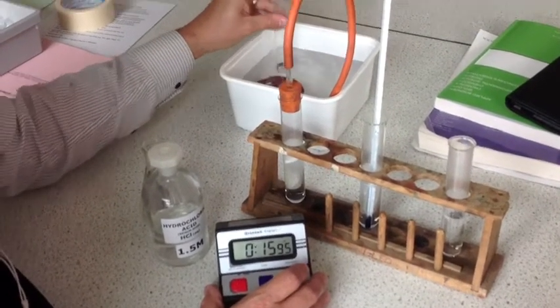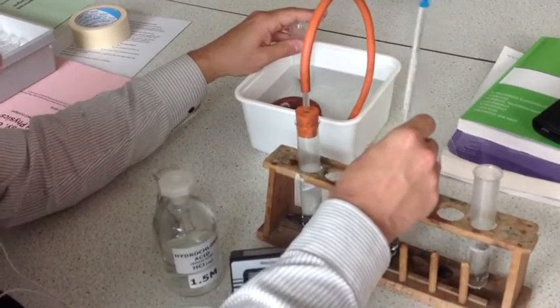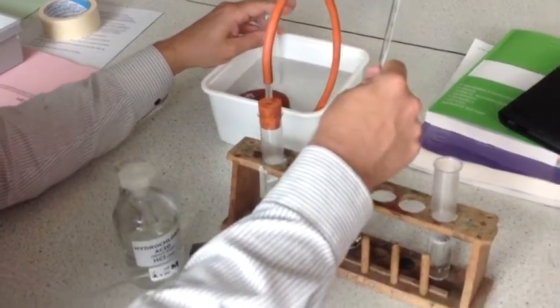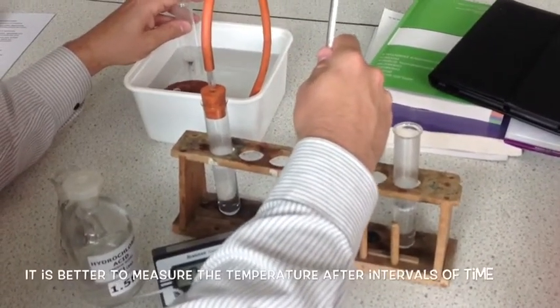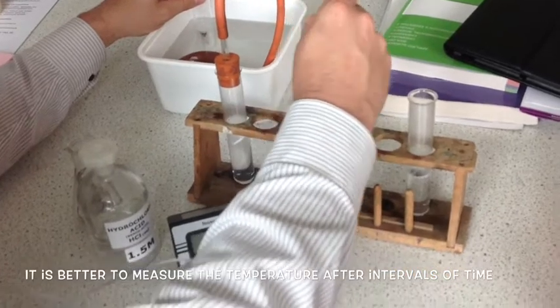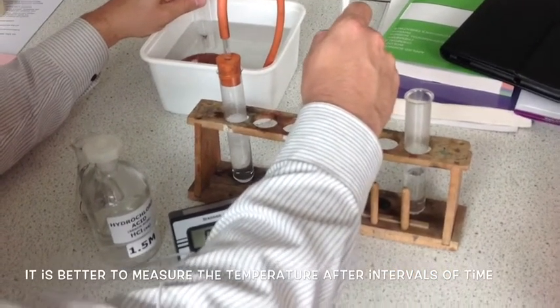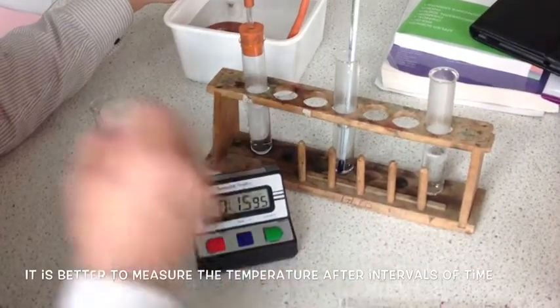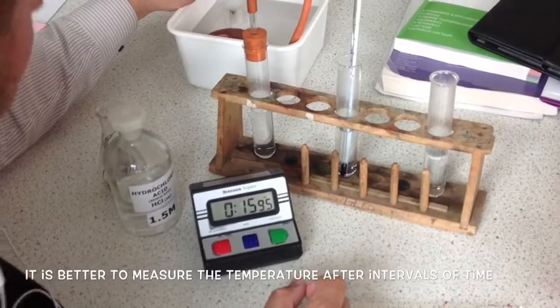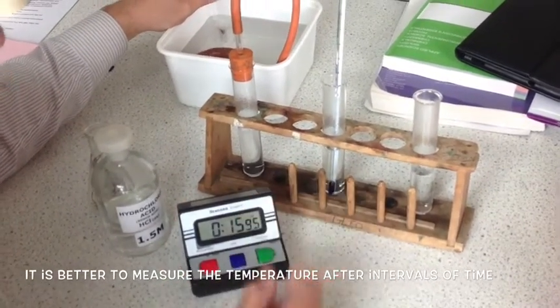Right now, there's one tube of hydrogen. This is nearly finished reacting. You can see that the temperature here has risen to currently it's about 46 degrees. And as I said, all of these are acceptable ways of measuring the rate. It's all to do with basically some way that you can numerically compare different reactions that are happening.